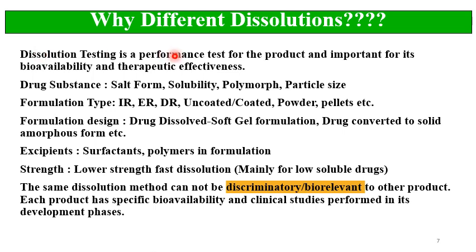So the dissolution test should be specific. Dissolution is important for the product's bioavailability and its therapeutic effectiveness. So different products cannot or should not have the same dissolution testing conditions and acceptance criteria.